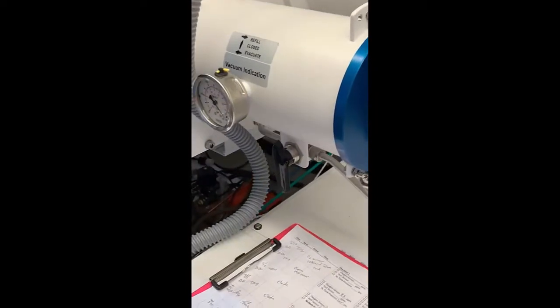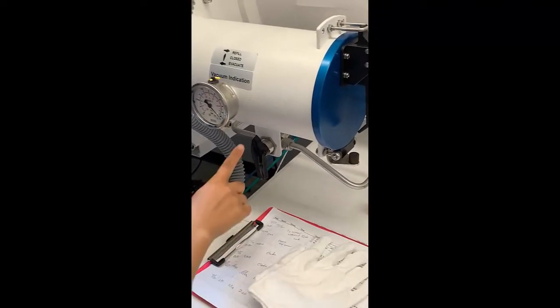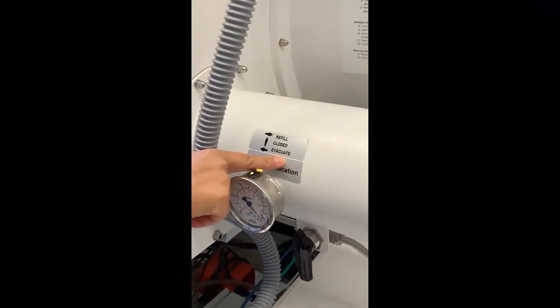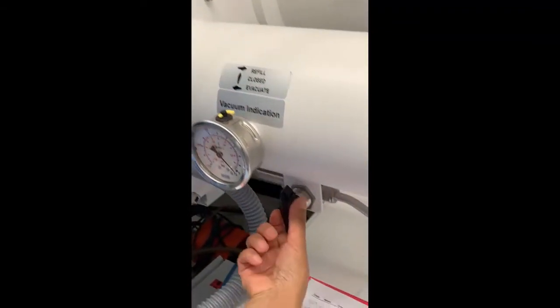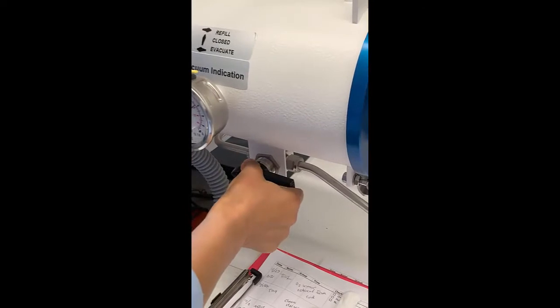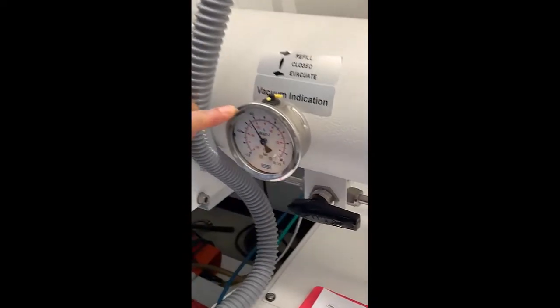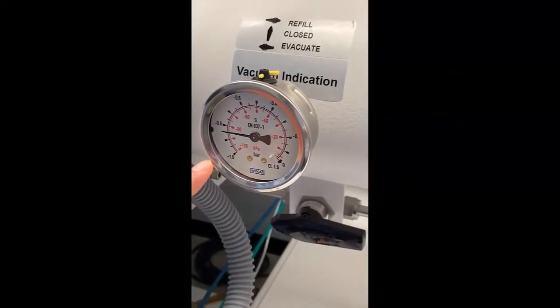And then you begin to evacuate and refill. This step must be done three times. So to evacuate, you turn the black lever all the way to the left until the pressure decreases all the way to negative one.